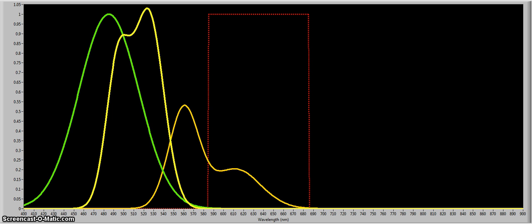Looking at the chart, 2 additional items have been added. One, the illumination source, a green LED, depicted here. And second, an optical spectral filter or notch filter has been selected to coincide with the fluorescence while knocking out and removing crosstalk from any little bleeding through of the illumination source.